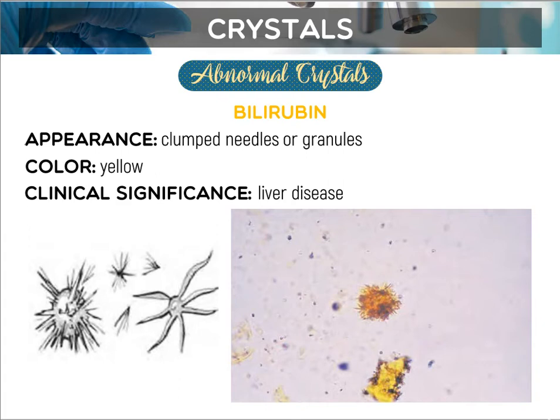Alright, bilirubin, your third wheeler, seen as clumps, needles, or granules. Of course, bilirubin's color is yellow. Alright, so much for that. Liver disease has three: bilirubin, leucine, tyrosine.